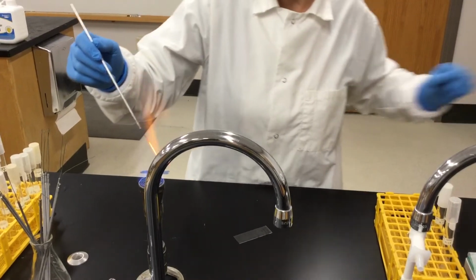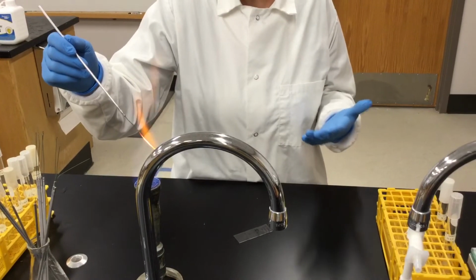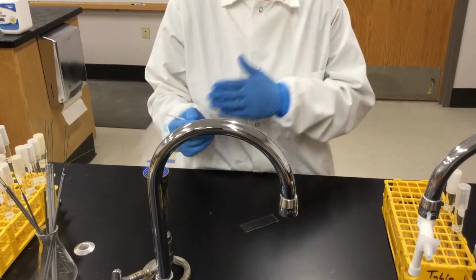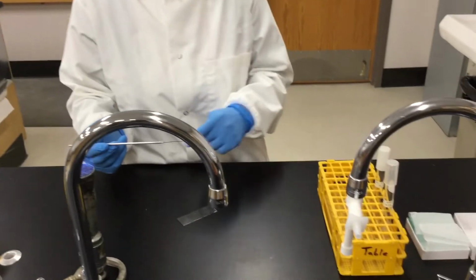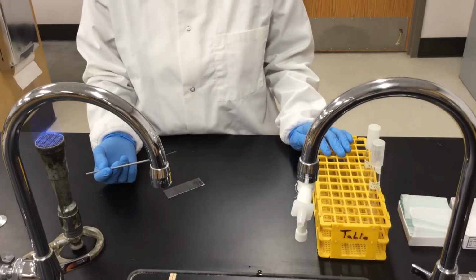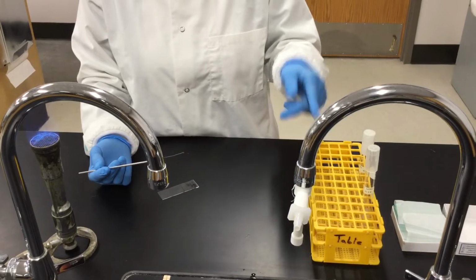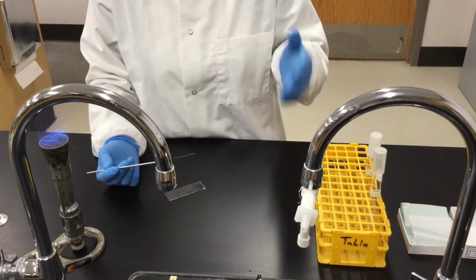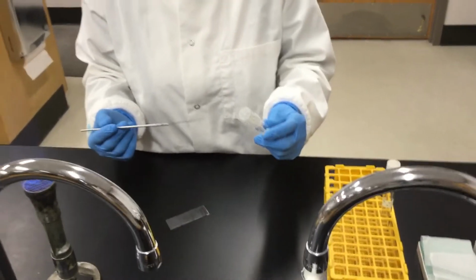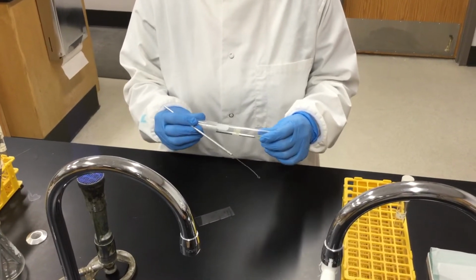In practice, you don't necessarily need to use a sterile loop, but you don't know if whoever used that loop before sterilized it. So that's why you sterilize it before putting the water. And then you have to let it cool enough so that when you introduce the loop into the agar to grab the bacteria out of the agar slant, you don't kill the bacteria or destroy the actual microorganisms, and as well you don't damage the agar.